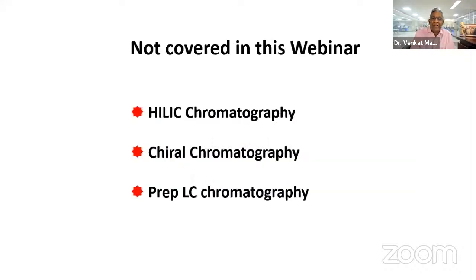Okay. What I will not cover in this seminar is what is called HILIC chromatography, chiral chromatography, and preparative liquid chromatographic systems, because each itself is a separate topic and each requires more than a couple of hours to talk about. Therefore, I will defer.